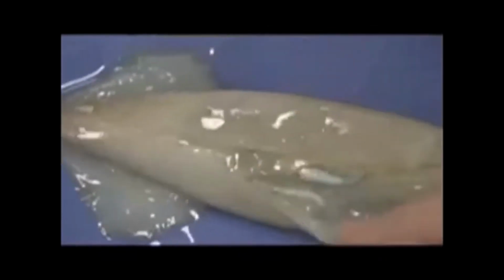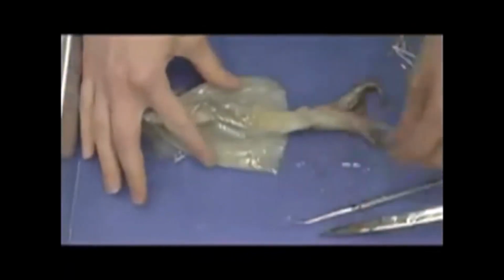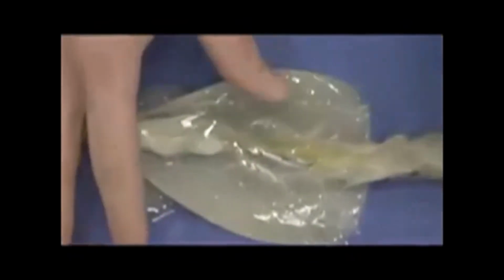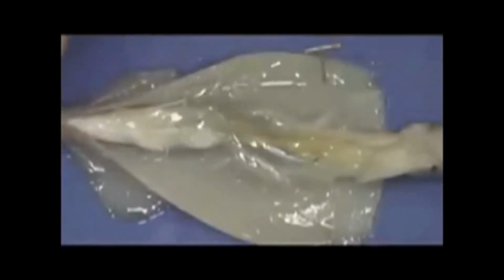And once you have your squid cut down the middle, it's very easy to open it up. First thing you see here is the silvery ink sac. You'll probably be able to see on either side those two feathery gill structures. Once your squid is nicely open, you can take a good look at the internal anatomy.